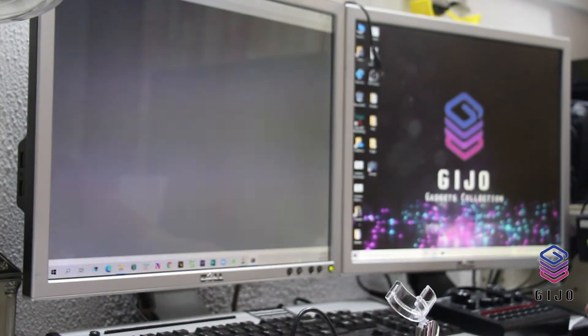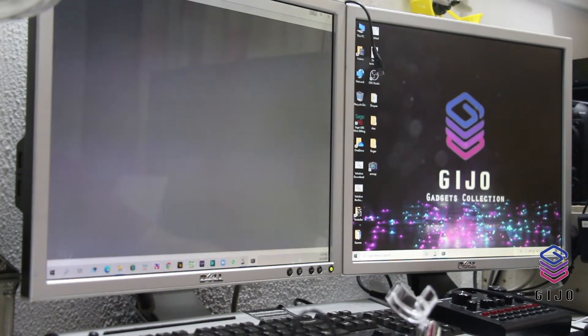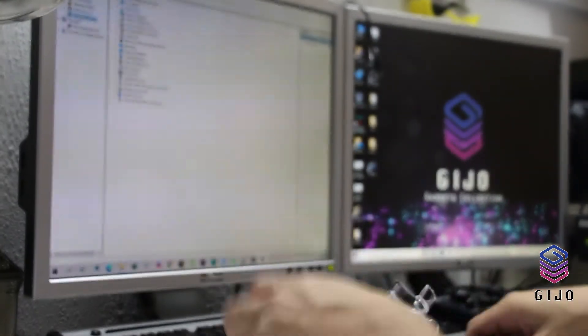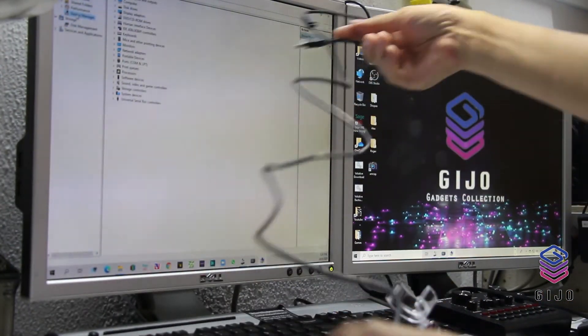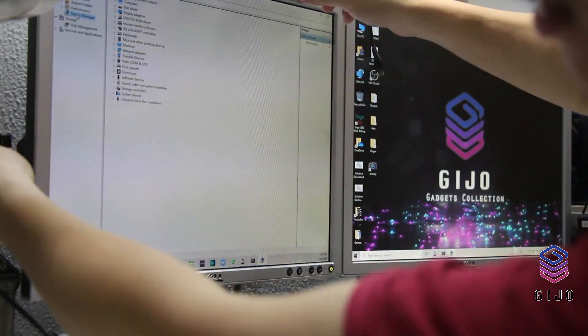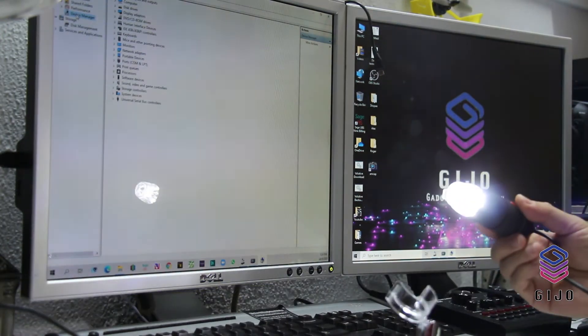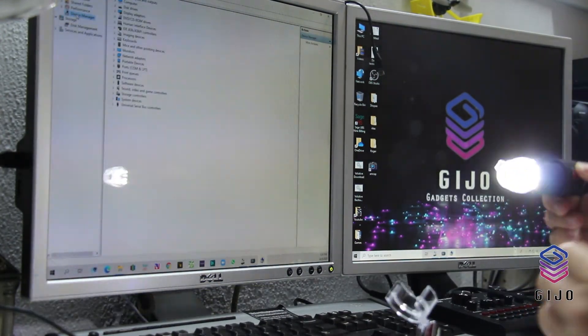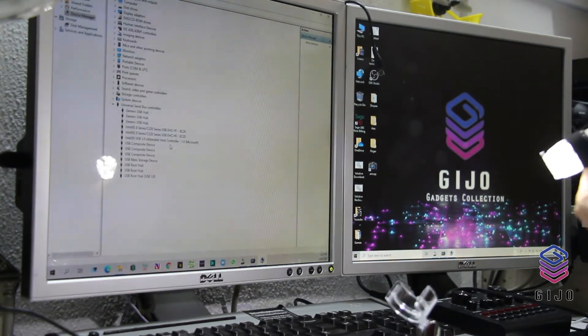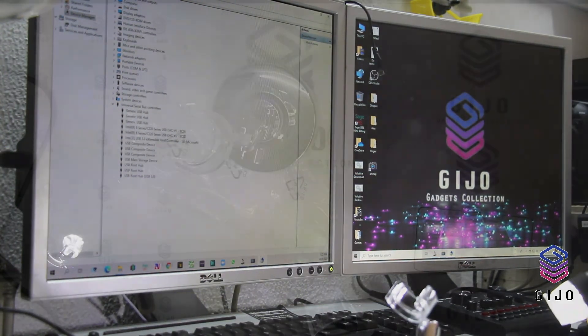MCAP — that's huge! Let's find out. Before that, let me open the Device Manager first, just to see if the USB driver has been installed. There you are — this is a USB device. Wow, straight away the LED light comes on. So I guess it has been installed.